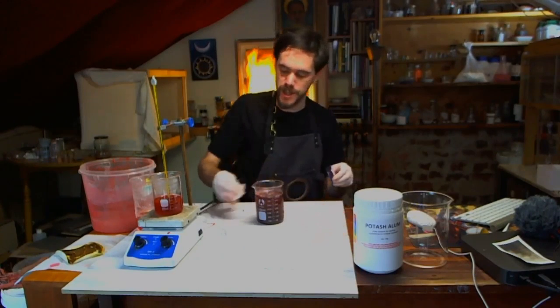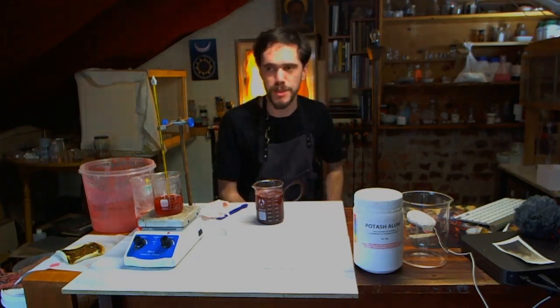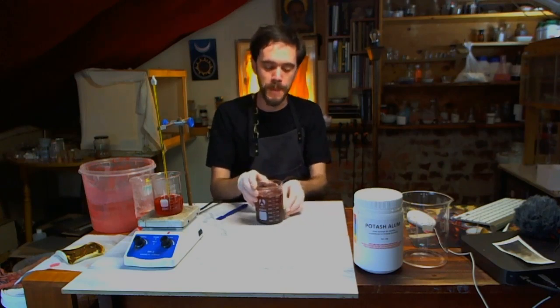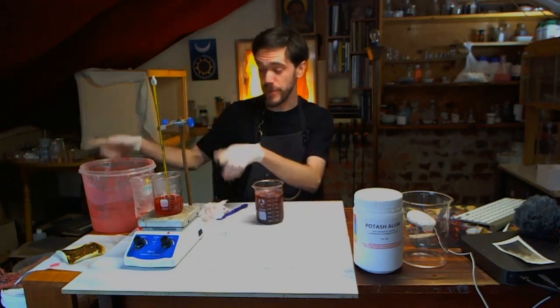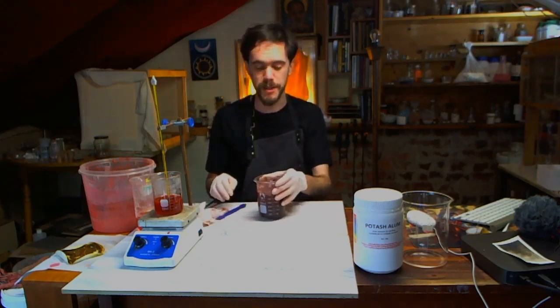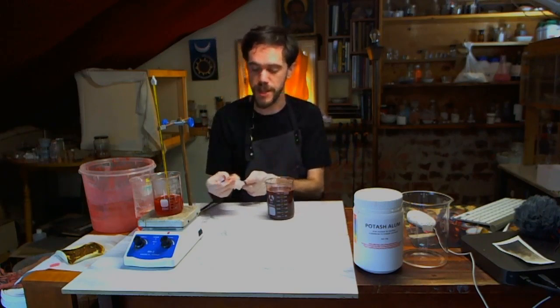from memory, when I've done 100 gram batches, I've potentially got close to maybe 35 to 40 grams of pigment out of 100 grams. So that's about 30 to 40% yield. So that would make a kilo give you about 300 plus grams, I reckon. And part of doing these experiments is to try and find out what the most viable method is. But I feel like we could improve on that 30 to 40% yield.